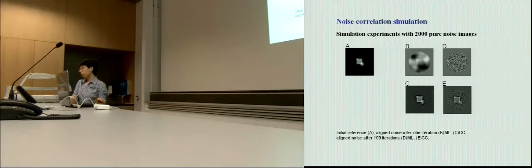No. When we have noise, and that's what I showed here from some simulation experiments, noise can be reduced somehow by increasing the number of images, but not as much as we think.